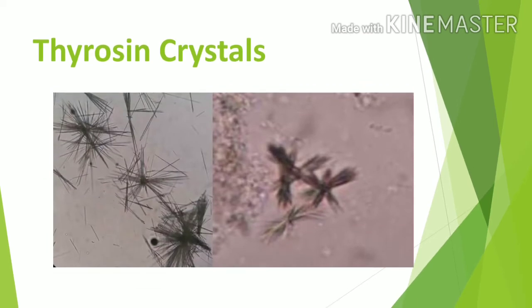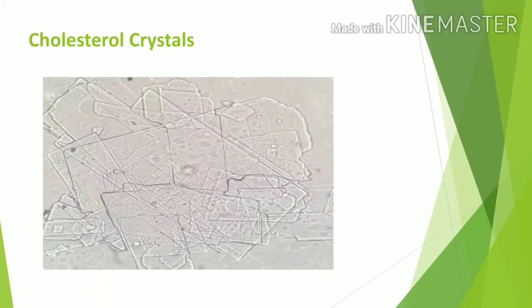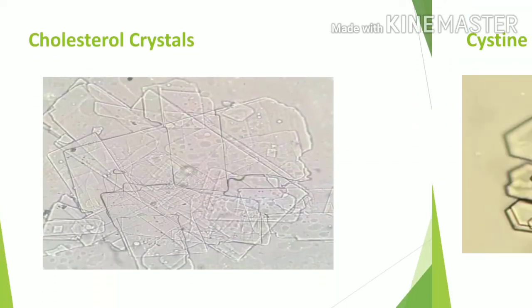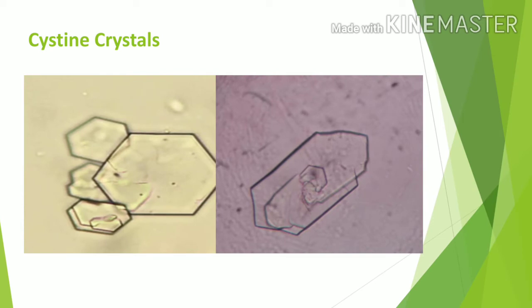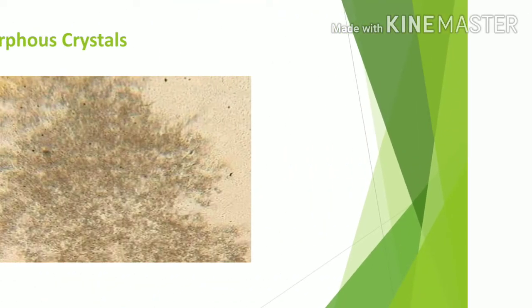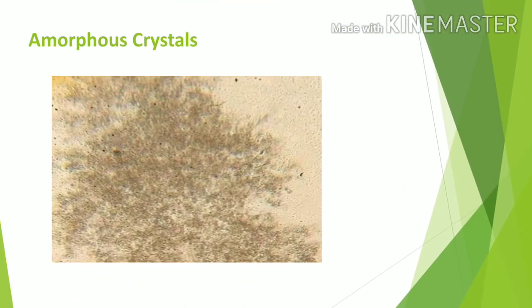Next, Tyrosine crystals — this is a needle shaped crystal. Then cholesterol crystals. The next is Cystine crystals. The next crystal is amorphous crystals — this is a sand-like crystal.